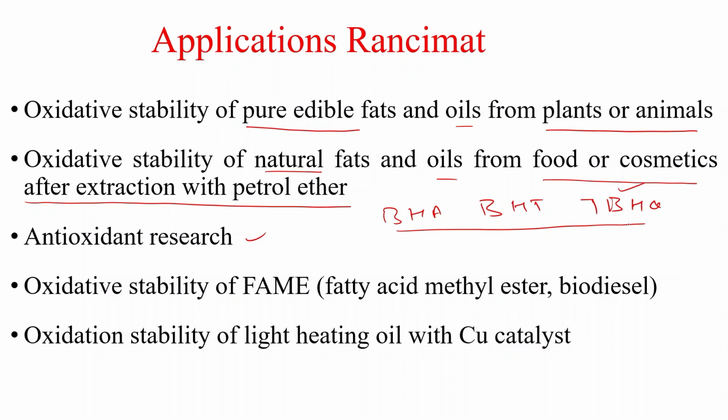So TBHQ, since this is the strongest antioxidant, it is expected that the induction period will be higher in this case, because it will prevent the oxidation.